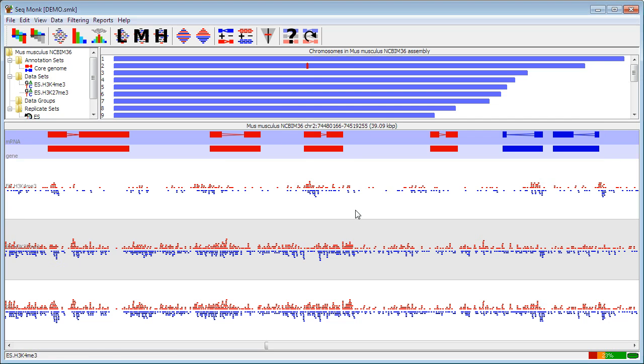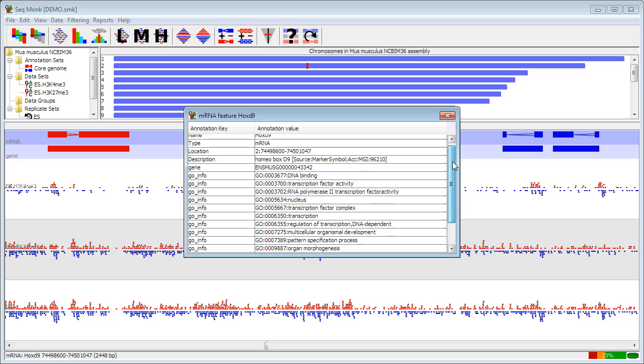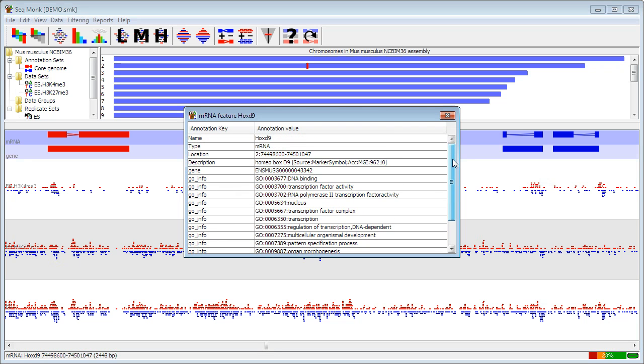For any feature that you see in the display, if you want more information about it you can simply double click on the feature. And it will bring up a box showing all of the different annotations that that feature has. Any of the annotations that you see in here are searchable with the find tool.